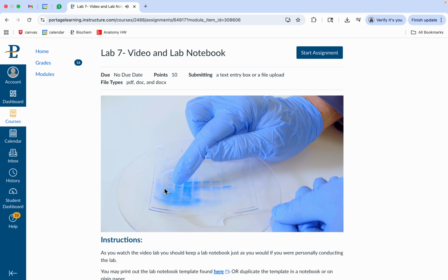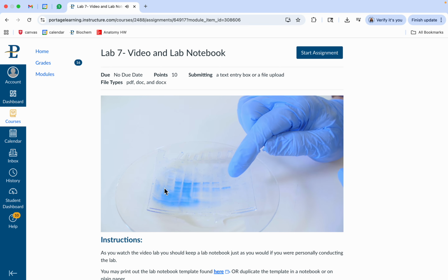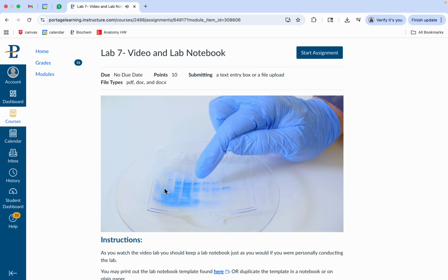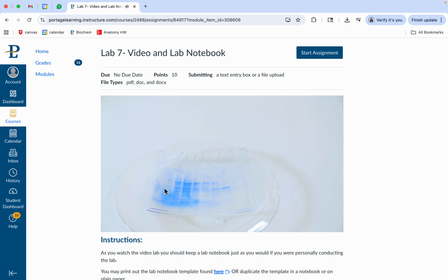But nonetheless, as you go from this side to the next, you notice that this band at 45,000 Daltons sort of grows in and gets darker, meaning that it is more highly concentrated after the CM column, which is what we want, than any other proteins. That means along the way, the heat denaturation, the ammonium sulfate precipitation, after the column, we actually kept getting more of our GOT, which is the goal of this experiment. All right, so this helps us to bring to a close the experimental part of this experiment 7.